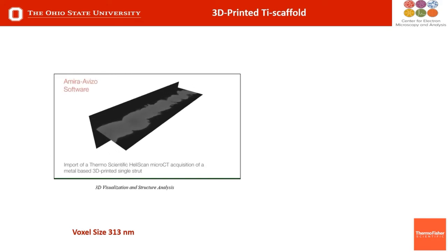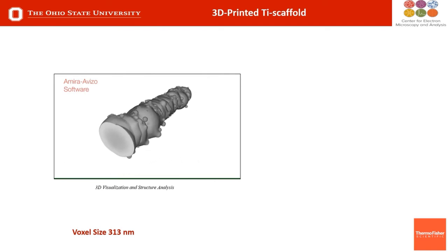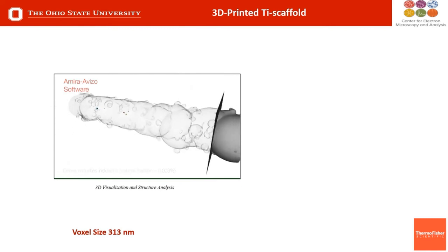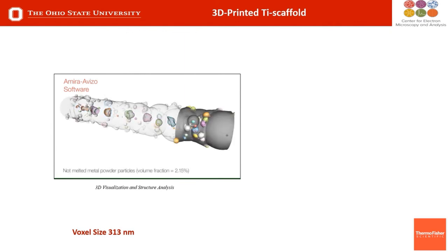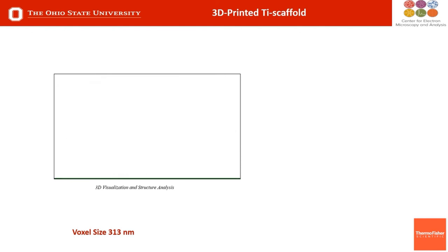Now, following in this powder example, we have a very nice additive manufacturing facility here at OSU. And so if you take these powders, they can be used to 3D print scaffolds for human use. Or at least that's the attempt, right? We want to mimic scaffolding that would be used in the body currently by conventional methods. We'd like to use 3D printing to print specific scaffolds. So imagine you could measure someone's aortic cavity and print out scaffolds that fit perfectly into their aortic cavity, as opposed to how it currently works.